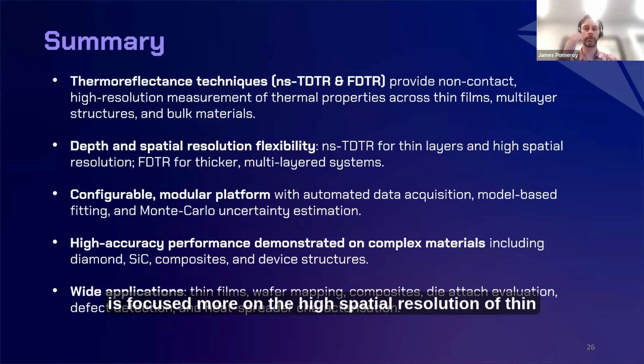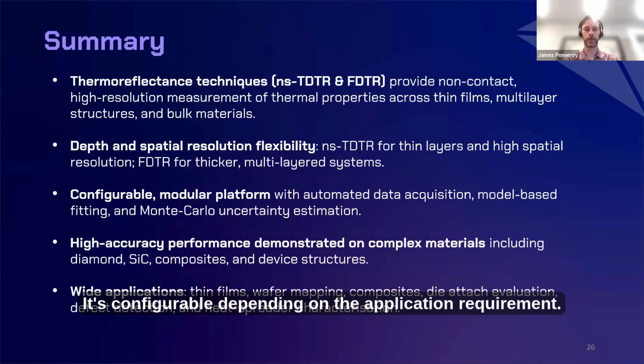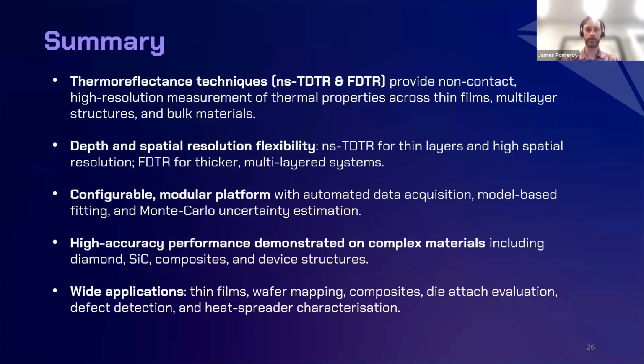Nanosecond TDTR is focused more on high spatial resolution thin films, FDTR on larger spatial resolution thicker films, both suitable for multi-layered systems. It's configurable depending on the application requirement. Hopefully I've conveyed that there are a wide variety of applications.